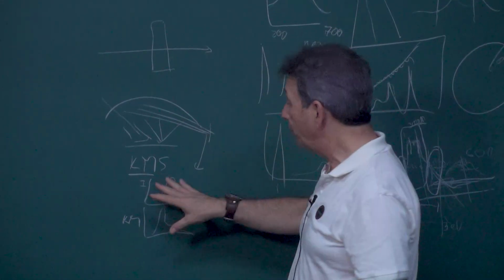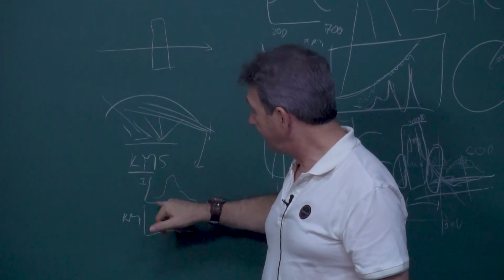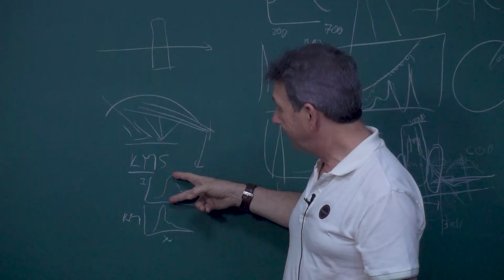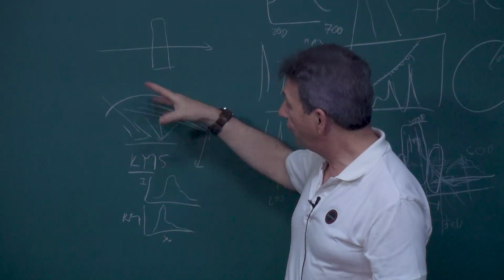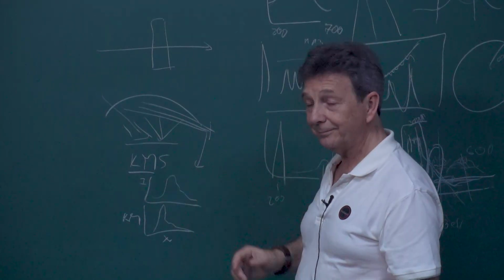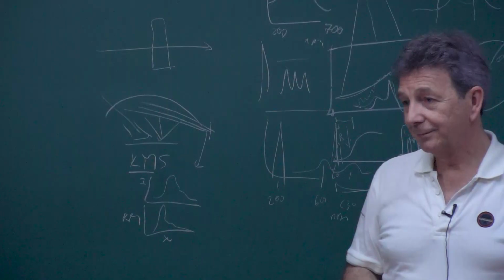It is a way of treating this data, the intensity against wavelength, and by considering all this scattering, it will be more quantitative.